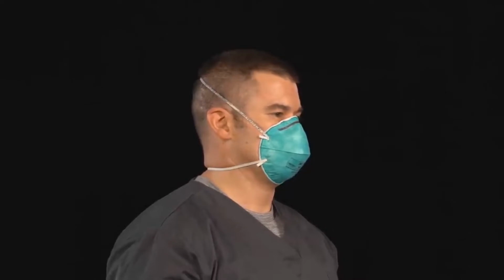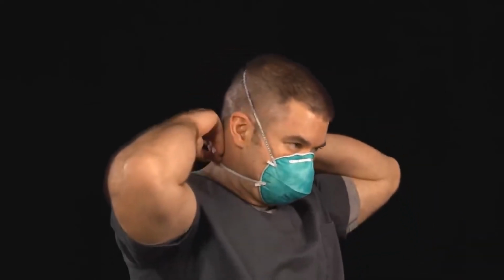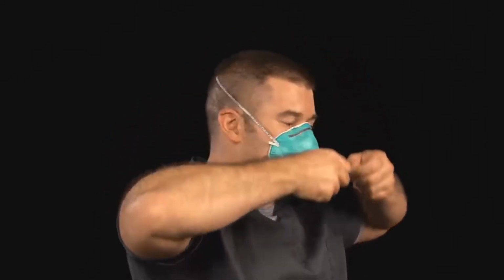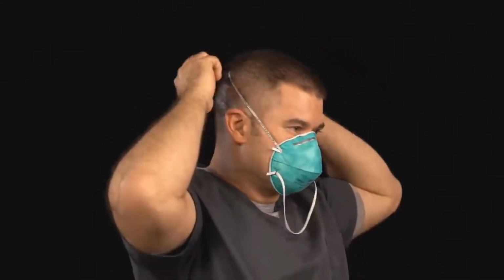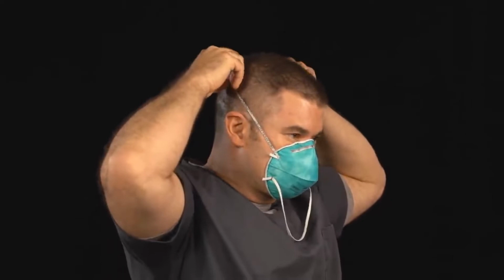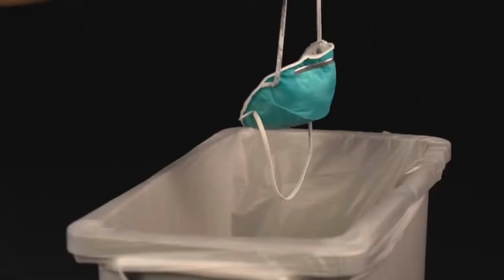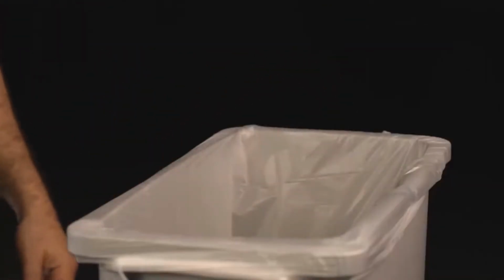Next, remove and discard the respirator or face mask. If you are wearing a respirator, remove the bottom strap by grabbing only the strap and bringing it carefully over your head. Grasp the top strap and bring it carefully over your head, and then pull the respirator away from your face without touching the front of the respirator.